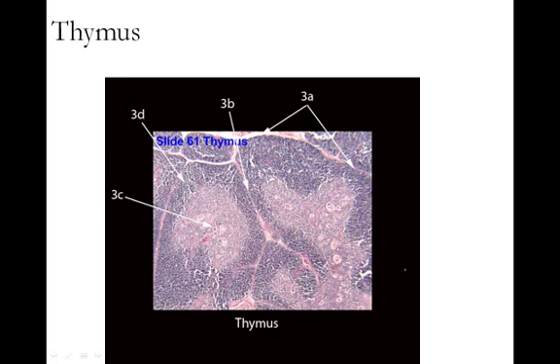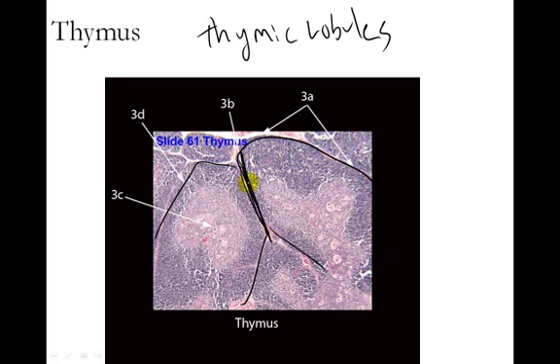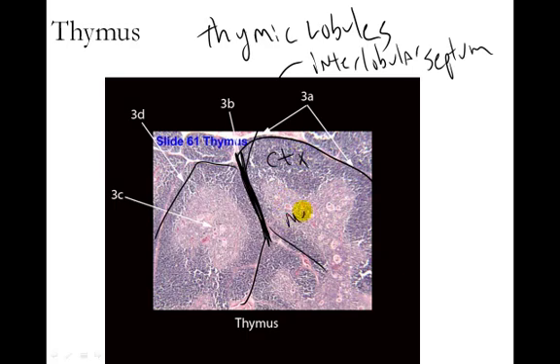The thymus has some immune function and is a very lobed gland found above the heart. It's mostly degenerated in adults but very large in embryos and fetuses. The thymus is set up in thymic lobules, and each lobule is divided from one another by what's called an interlobular septum. Each lobule has a cortex and a medulla. Those are important things for recognizing the thymus.